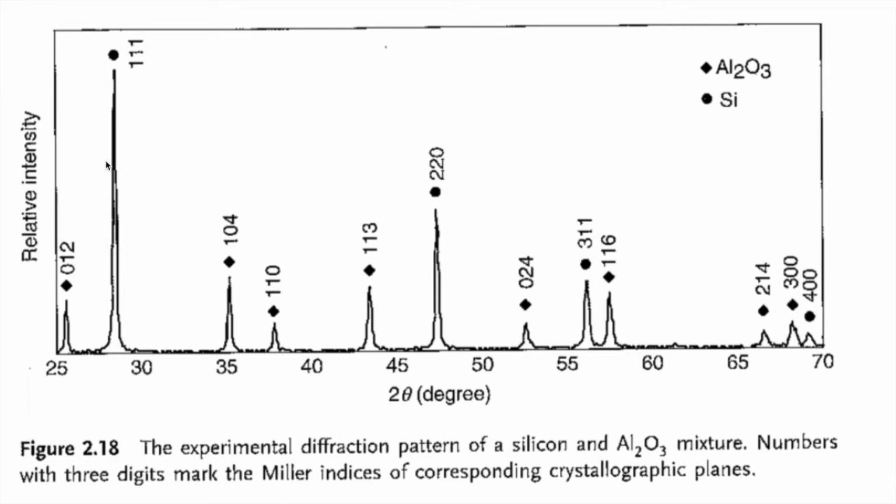It satisfies Bragg's law. And so typically we have a series of peaks against a background, so basically where the X-rays are destructively interfering. And so these peaks really tell us about the diffraction event that's occurring.